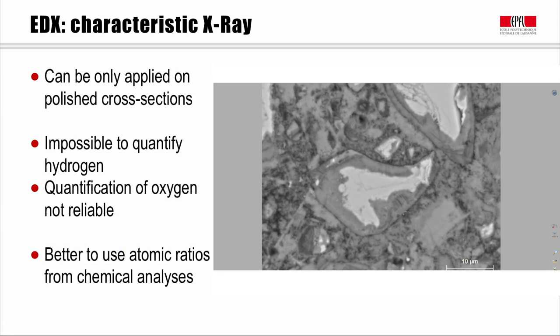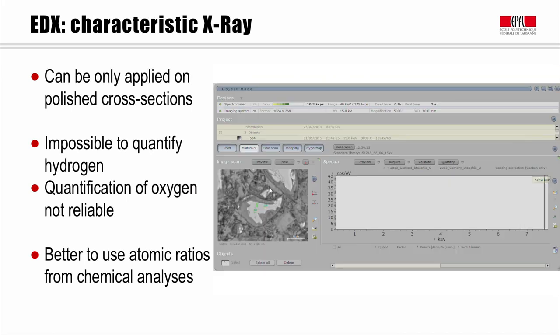For the identification of phases, we do not have any chemical evidence from BSE alone. Let's now carry out an EDX analysis on this microstructure to identify several phases we assumed to be present. On this video, the quantification of an alite phase is shown. We spot several points of alite in the microstructure in this grain and start the EDX analysis to get the chemical composition of the phase. The quantification is very fast, and now we can have a look at the results.